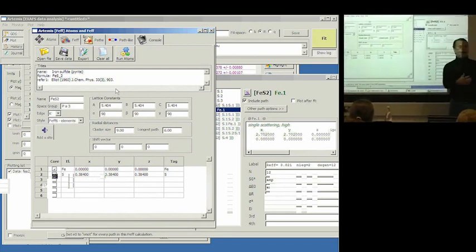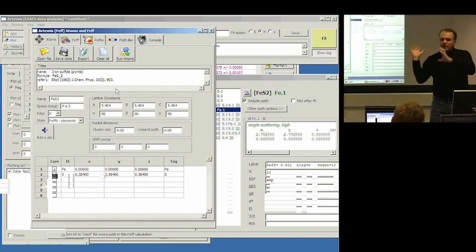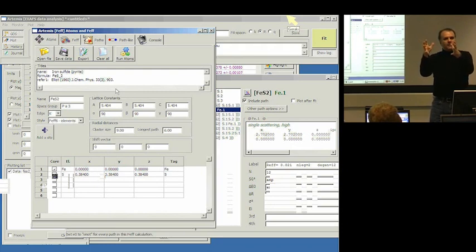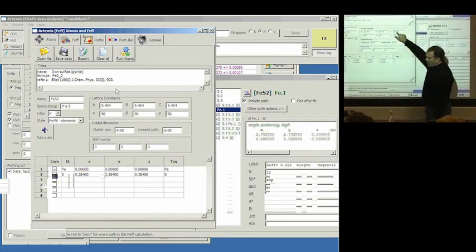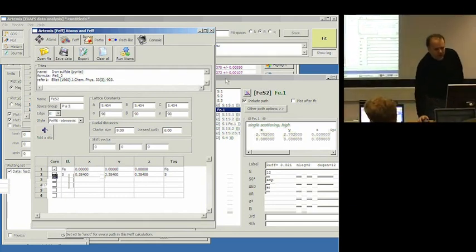What I'm trying to say is that compared to the crystal data, what we measure in our sample for the EXAFS measurement, the lattice constant either needs to be bigger or smaller. The crystal either needs to expand isotropically compared to the crystal data or contract isotropically. So there's really only one overall parameter that determines all of the delta R's in the fit, just like there's only one parameter, that one, that determines all of the R's in the fit. Here's how that gets parameterized.